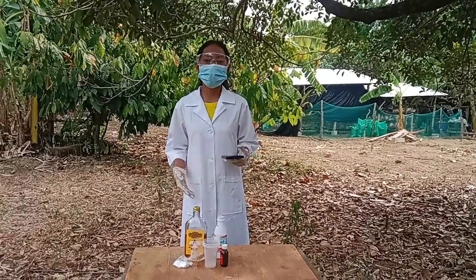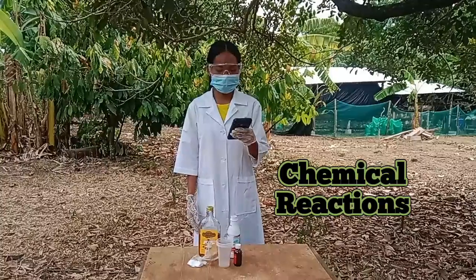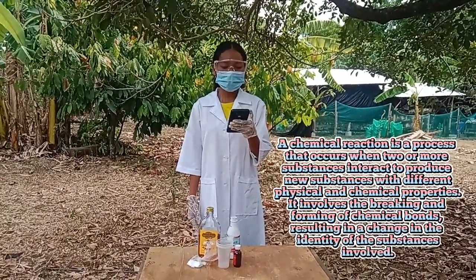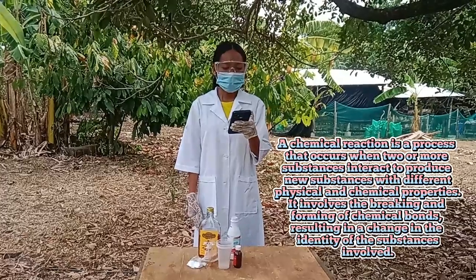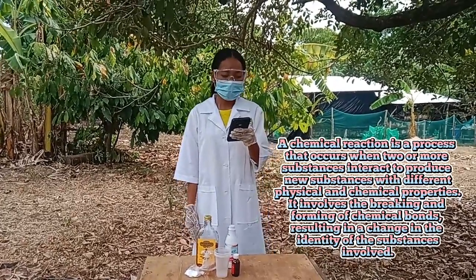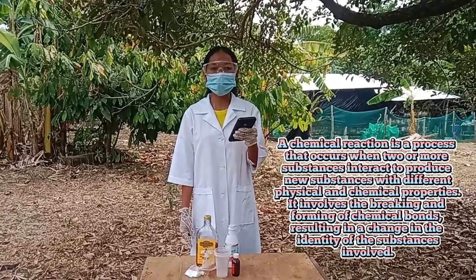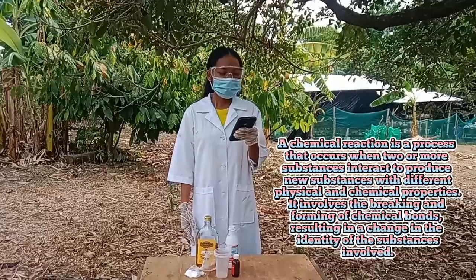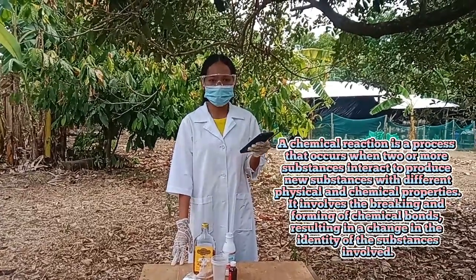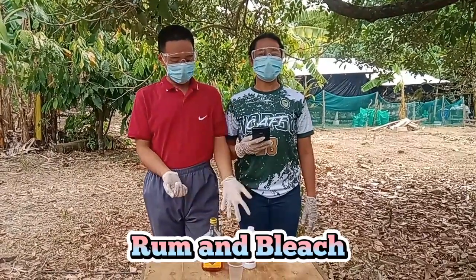So, good day everyone. We are going to demonstrate all about the chemical reactions. A chemical reaction is a process that occurs when two or more substances interact to produce new substances with different physical and chemical properties. It involves the breaking and forming of chemical bonds, resulting in a change in the identity of the substances involved. So our first experiment is rum and bleach.